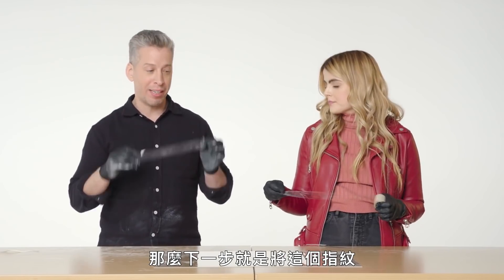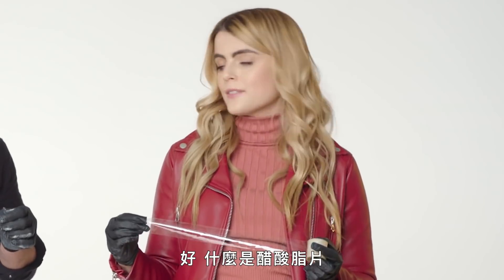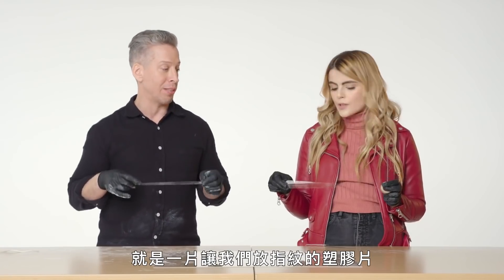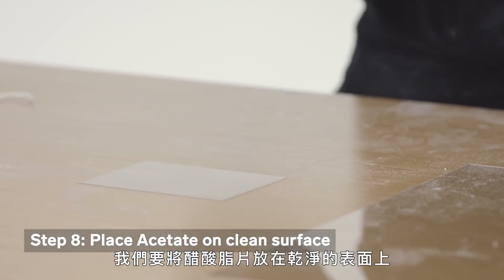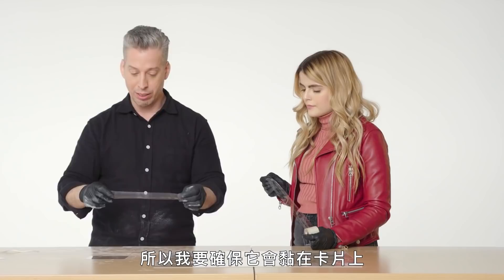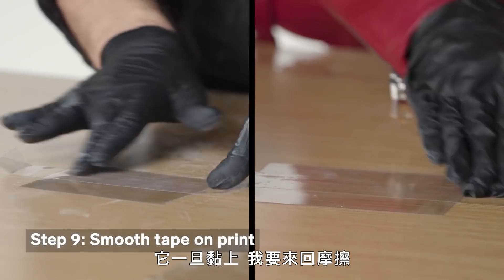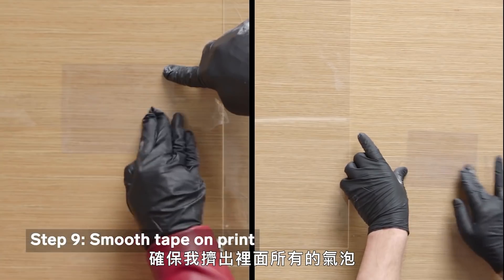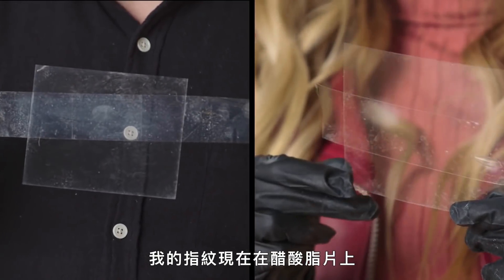The next step is to take this lift and put it onto an acetate — just a piece of plastic. We put our acetate on a clean surface, and since my fingerprint is right there, I want to make sure it gets on the card. The same way that I lifted it, I put it down, then rub back and forth to get out any air bubbles. And there we go — my print is now on the acetate.